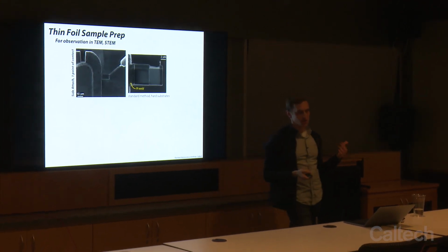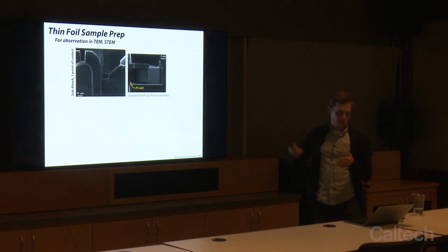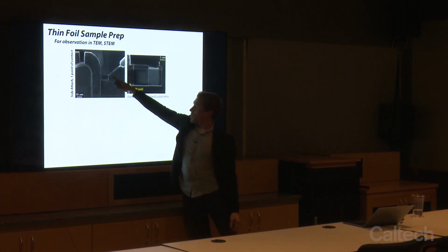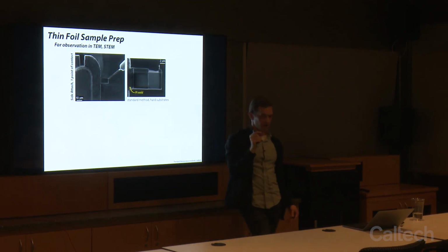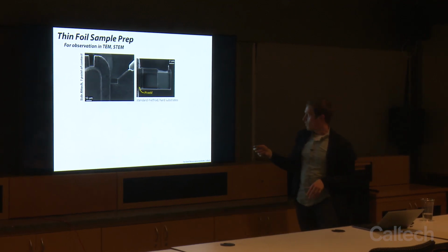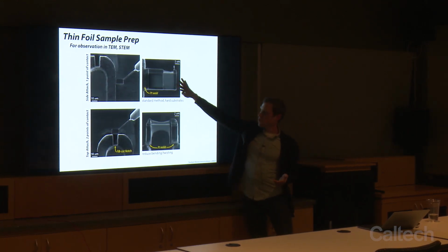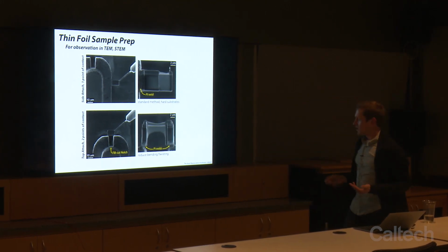You need a very thin sample, usually 100 nanometers or thinner. And we can use the gallium focused ion beam to physically cut it free and extract it from the sample. So in the next lecture, I'll talk about how we can use an omniprobe, a tungsten needle, to take a thin sample out of our bulk material that we've cut away with the gallium, and how we can weld it to the grid with platinum, again using the gallium beam, so that we can thin it down to electron transparency in a TEM, so get it less than 100 nanometers.